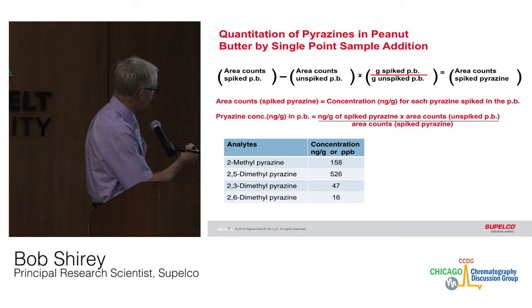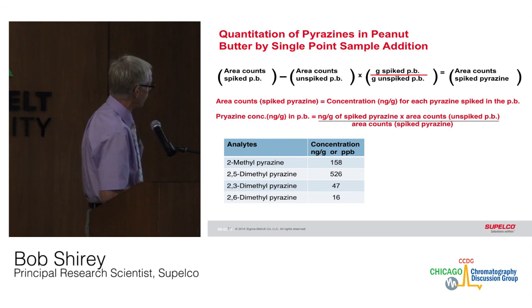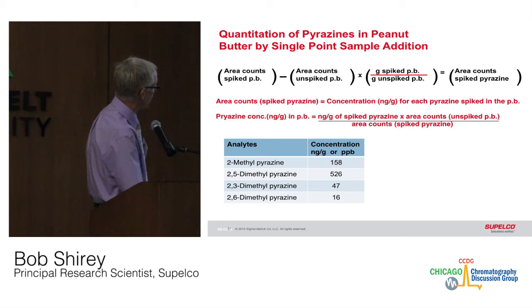And for these 4 pyrazines, you can see the results with 2,5-dimethylpyrazine being the essence of peanut butter. You can see it's a pretty high concentration level of that. Notice 2-methylpyrazine is at 158.